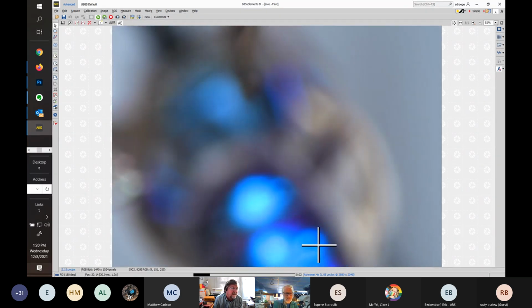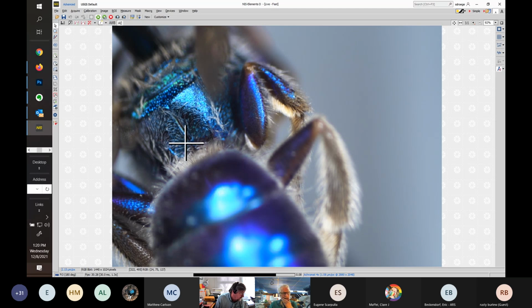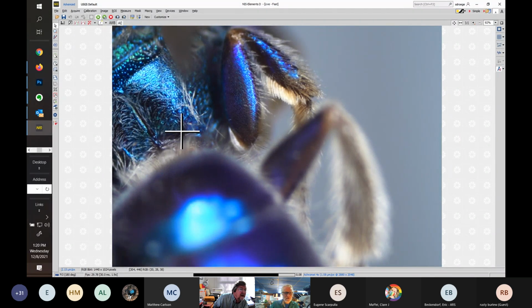Now I'm going to see if we can get the rear face. So we can to some extent here, but this rear face, again, this is the problem. I would consider this to be relatively smooth compared to that other aurata, that one type of aurata. It's a little bit difficult to pick out how much topography that is. It's not mirror-like for sure, but it does have some.